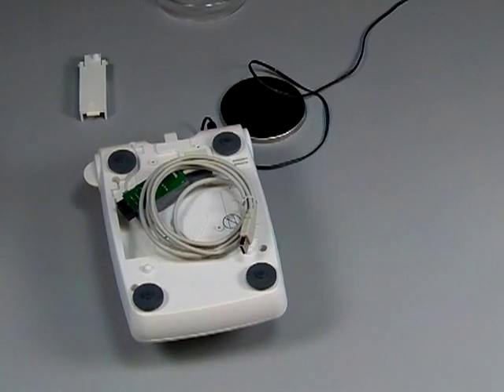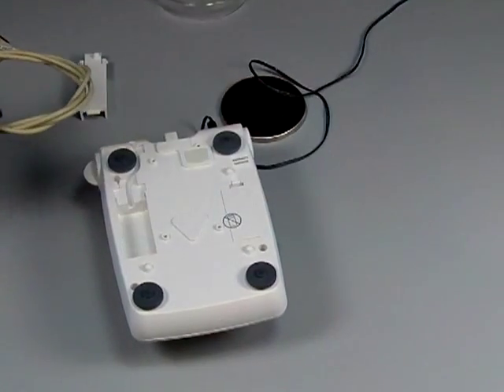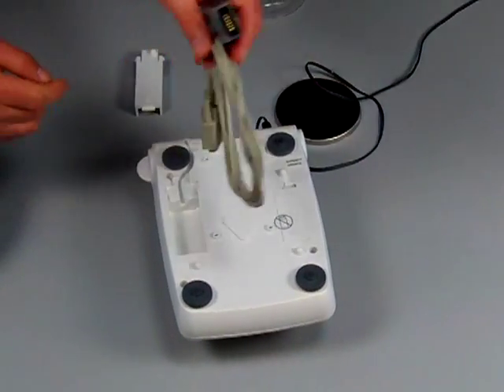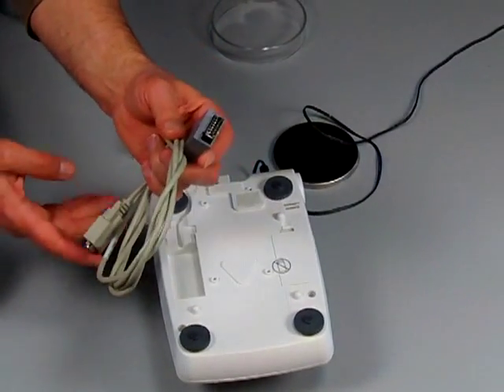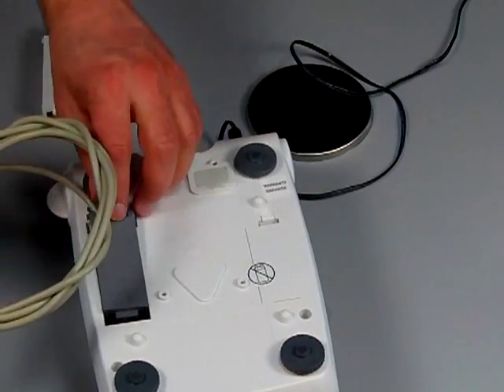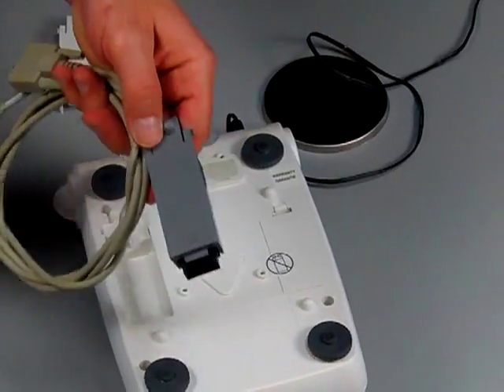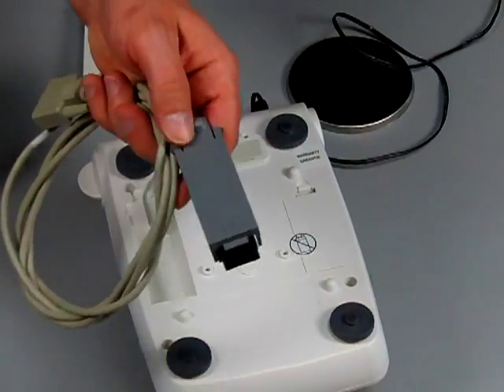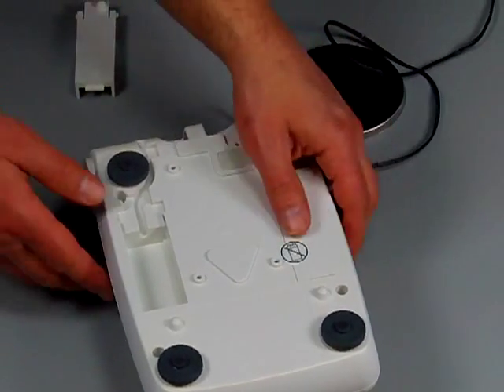If you want to go with an RS-232 interface, like if you were going to plug this into the Sartorius printer, it must be the RS-232 interface that you select. So this is the RS-232 module, and again it just slides right in. And you can see they're still producing these in gray, probably until they run out and then they'll change the color to white to match the scale.